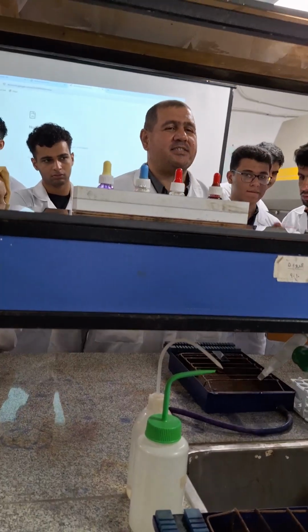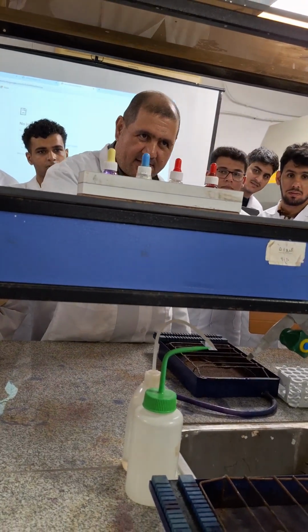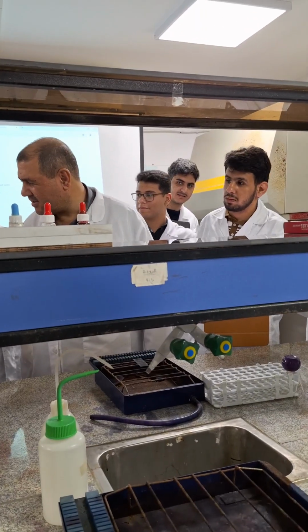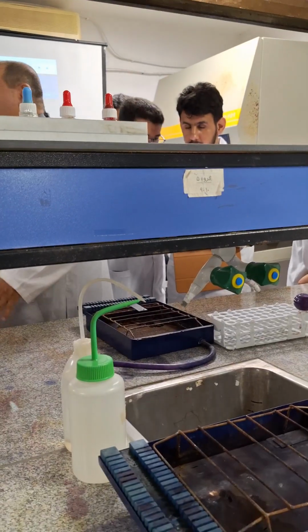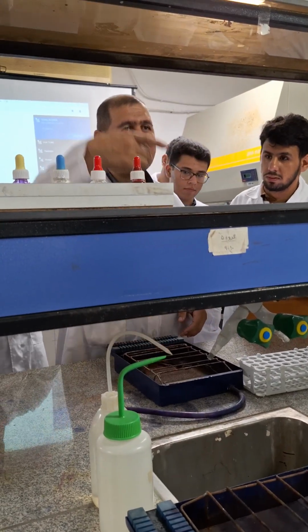Okay, what is smear? A smear is a thin layer of bacteria on a slide.